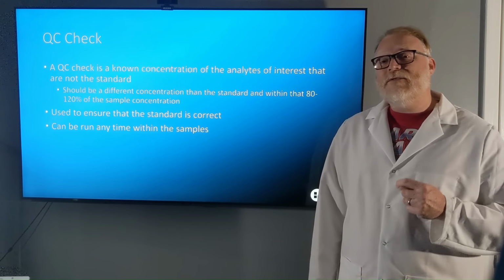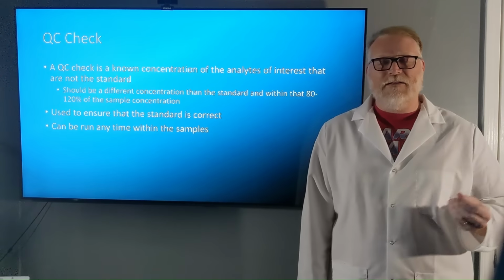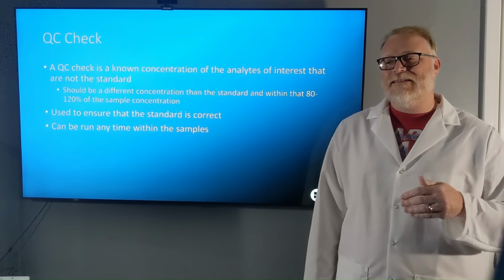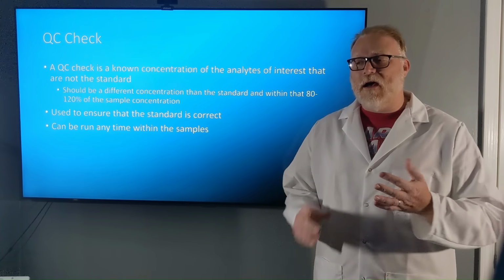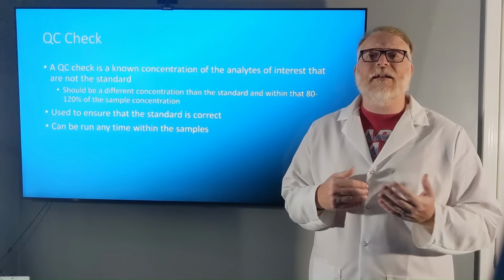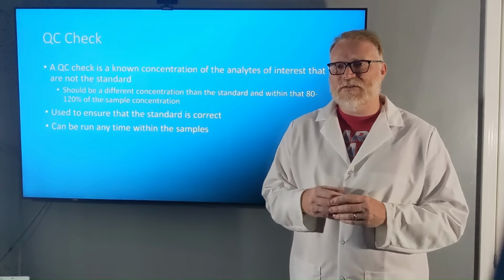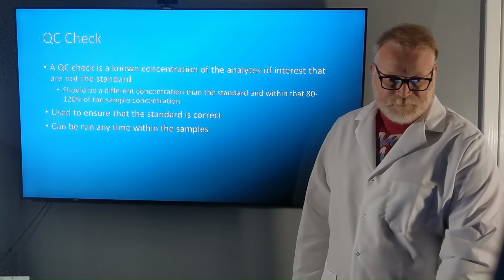Next is our QC check. Our QC check is not a standard, so you can't use your standard as your QC check. It has to be a different concentration other than your standard. And what it's going to do is it's going to check to see, is your standard giving you the concentration calculations that it's supposed to using this QC check.